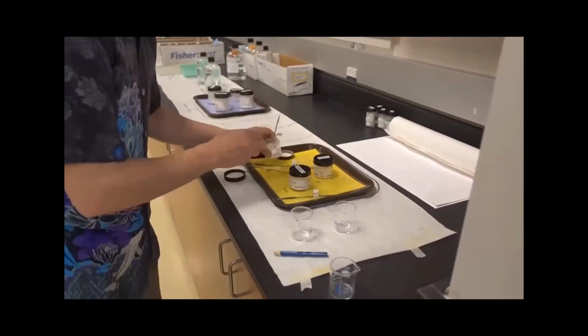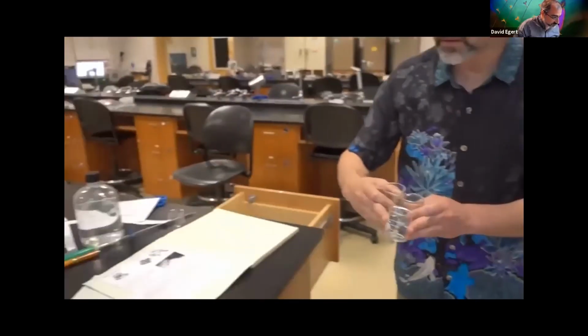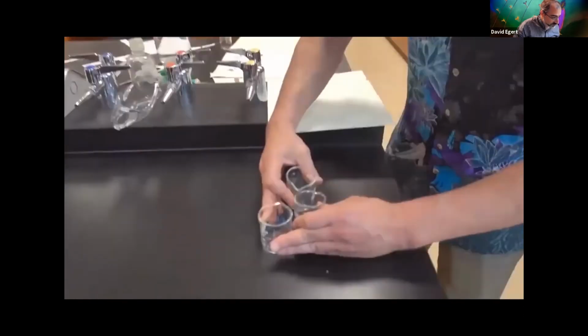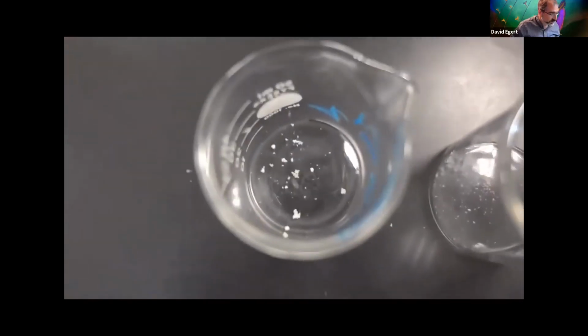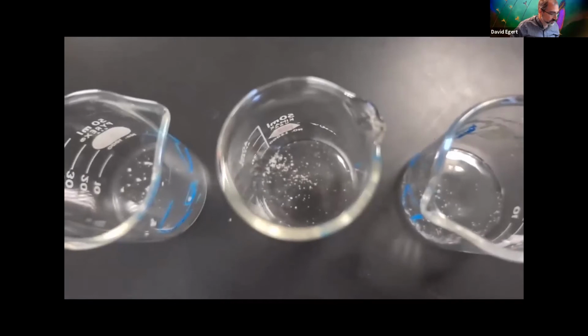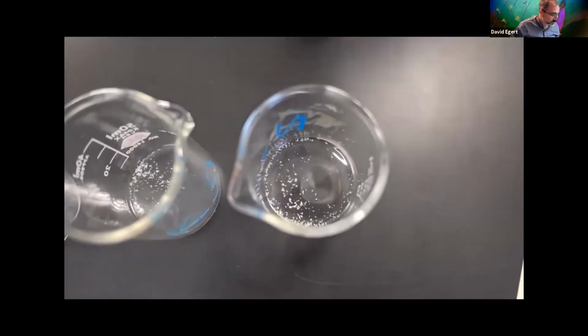All right. So I'm going to take these and put them with a black background where I think it's going to be easier to see. In each case, hopefully you'll be able to see these little white crystals at the base of each of them. Again, right here we have the sodium chloride, which is ordinary table salt.